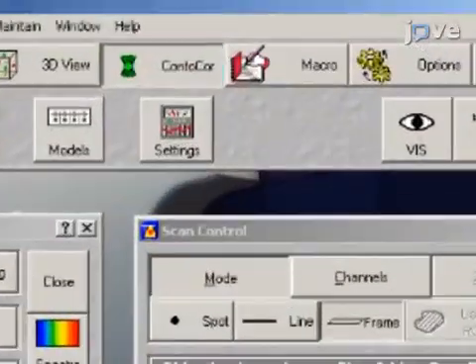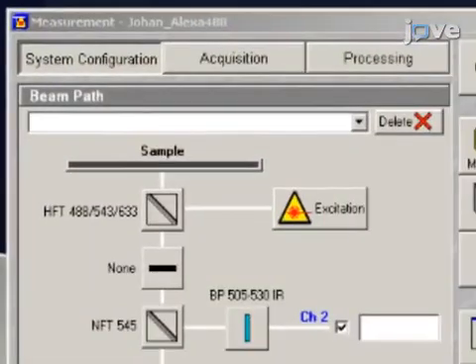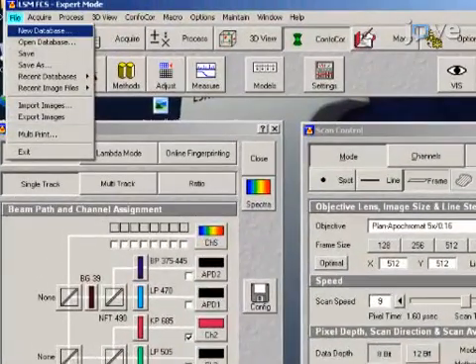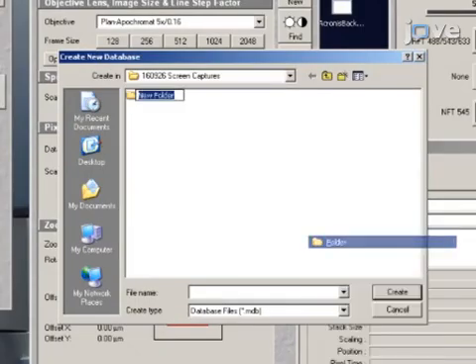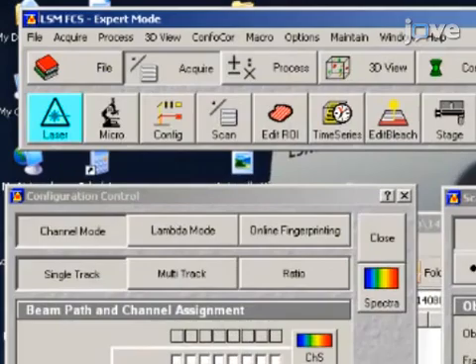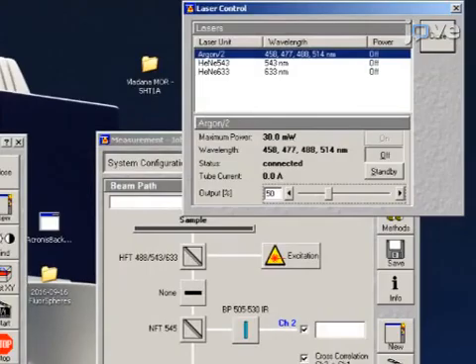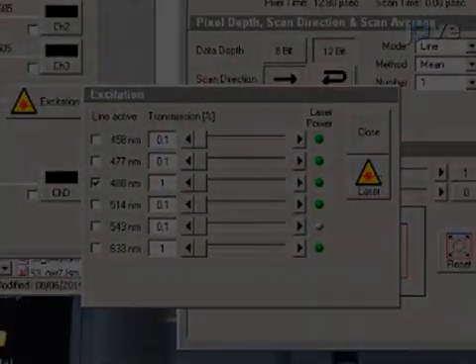Under the Confocal tab, press Measure to open the measurement window. Next, create a folder to save the FCS measurements. Start a new image database by clicking New under the File tab. Turn on the halogen lamp. Using the Laser button, turn on the relevant lasers for exciting the fluorophores. Then, specify the settings for image capture in the Configuration control window.